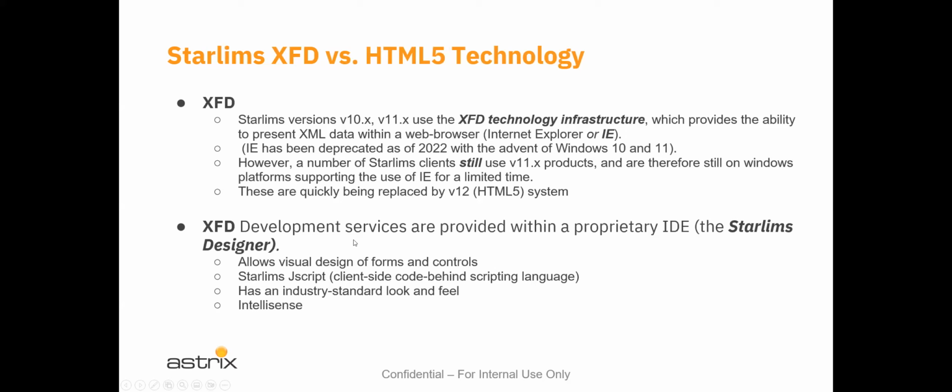So XFD are provided within a proprietary IDE, the STARLIMS Designer. And we're going to talk a little bit more about that again tomorrow when we have the training for that. But the designer allows for visual design of forms and controls. It handles any of the STARLIMS JScript, JavaScript. It's proprietary to STARLIMS. It's very similar to any of the other typical third, fourth generation programming languages, but it has its own idiosyncrasies.